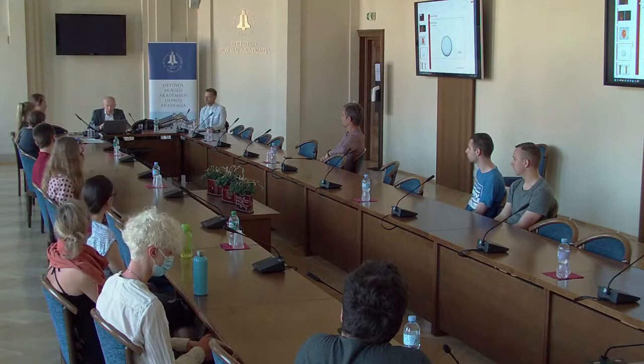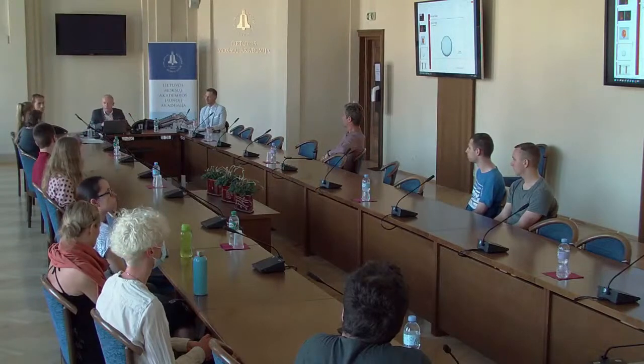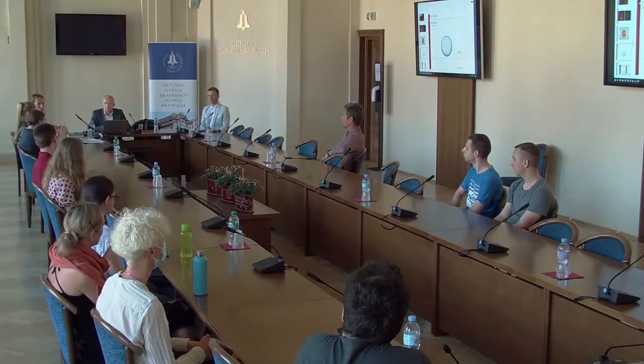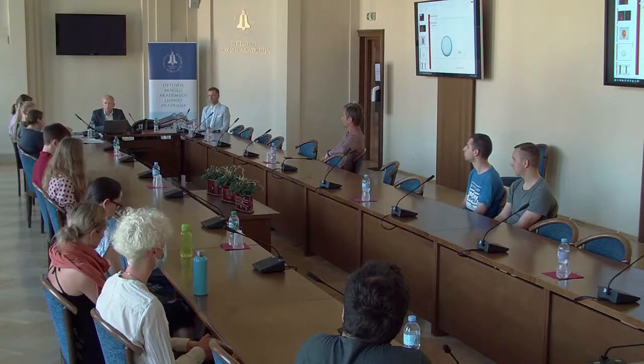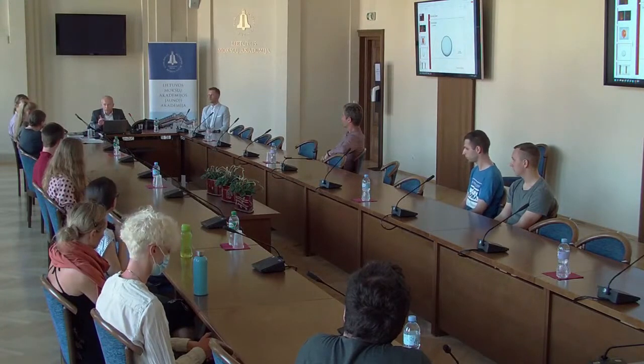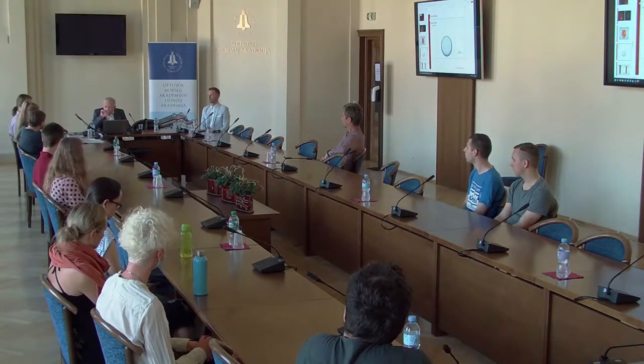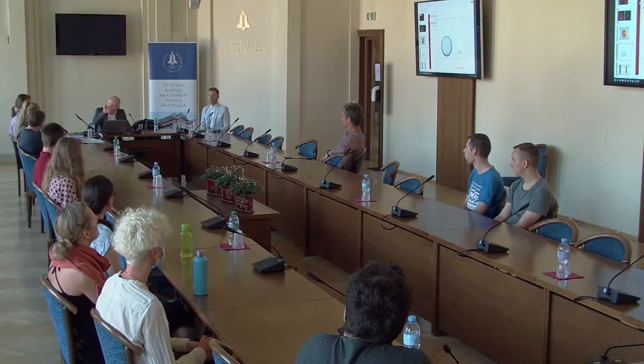Šiaip viskas yra matoma, bet kadangi yra tridimensinis vaizdas, mes galim viską matyti. Čia yra klijai, čia yra tas, čia yra tas. Viską mes darome. Aš Irmai duosiu tam tikrus failus. Ten yra plomba vienam dančiui. Labai gražiai matosi, kaip ji prikibusi. Ne visur prikibusi. Ir matosi labai gražiai, kad čia prikibusi, ten neprikibusi.